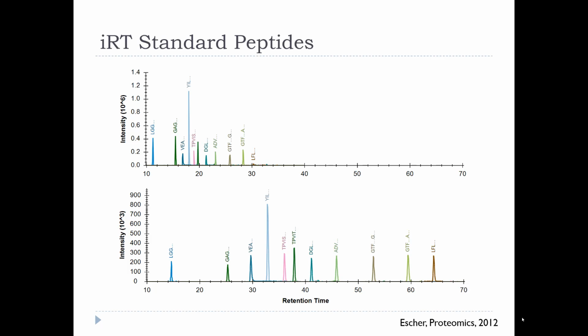And then for the paper, I encouraged them to do this experiment where we switch gradients to prove that we could get a reasonable prediction of retention time, starting with, I guess, a 45-minute gradient, which gives you a clue of how much of the gradient we span. We span about 2/3 of the gradient. In hindsight, I've seen data where I really wished we got a lot closer to 40. And then this is a 90-minute gradient.